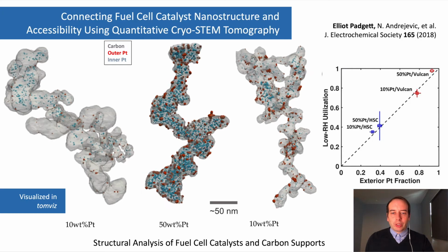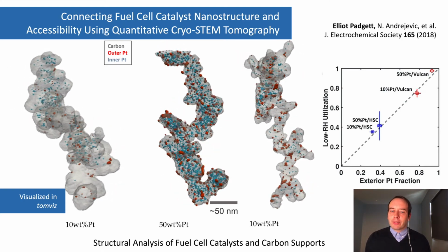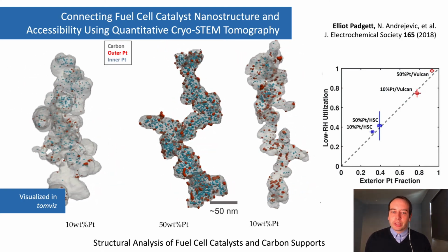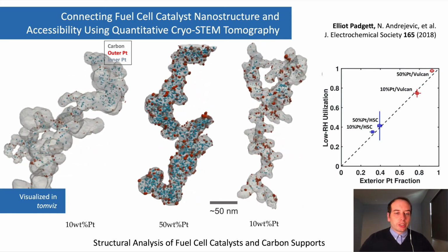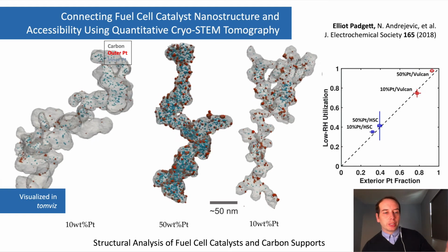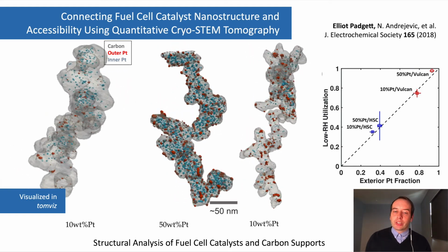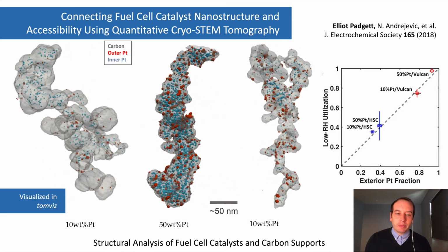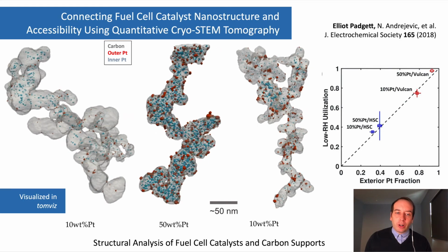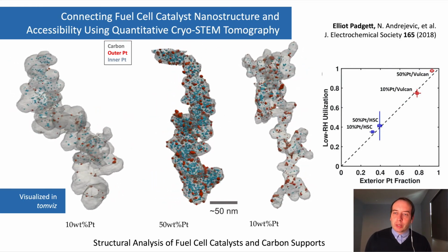Nanoparticles have lent themselves well to electron tomography, and it's found a lot of applications in clean energy nanomaterials, where the performance is intimately connected to the complete 3D structure, whether it's nanocatalysts for water splitting, hydrogen fuel cells, or electrodes on a battery. The surfaces are often engineered to maximize surface area where the reactions occur, and these complex morphologies are difficult to discern from a single projection image.